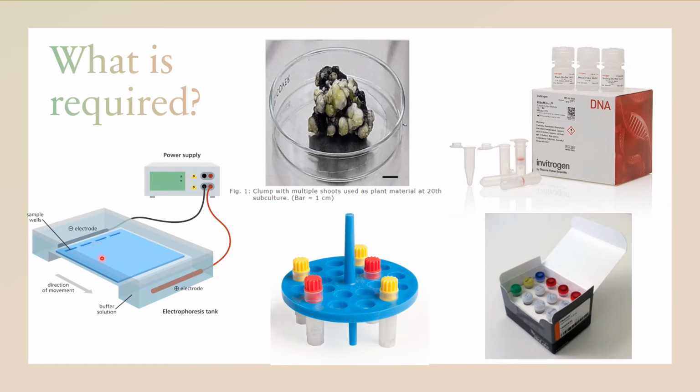So the DNA inside the well, when we load it, is going to have multiple variations of size depending on the source of DNA that we run. If it's a PCR product of RAPD that we were talking about just now, it will probably have a few bands. The bands will separate from each other, and the separation is based on size.